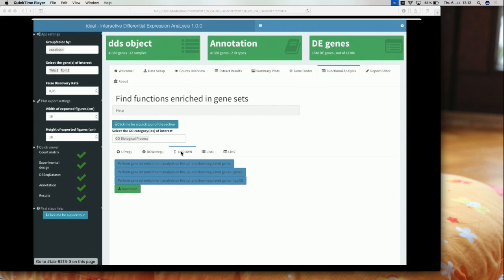Interesting, if we're going from DE genes to regulated functions, you take the up and down regulated genes, then you use the topGO method for that, which is quite nice because it really gives you some targeted GO terms which are meaningful. And again, with a flash forward on that, I'll skip to the report editor part of it, and I'll show you how it looks.